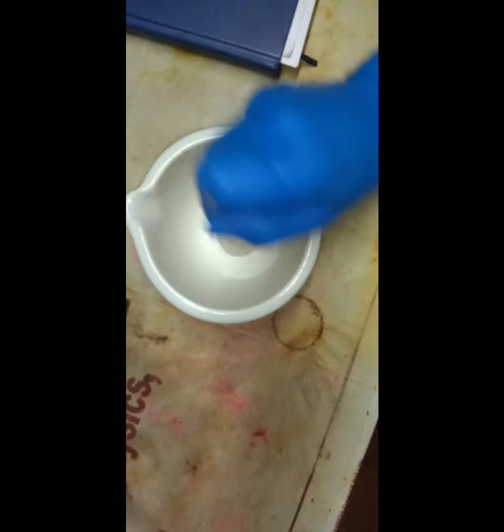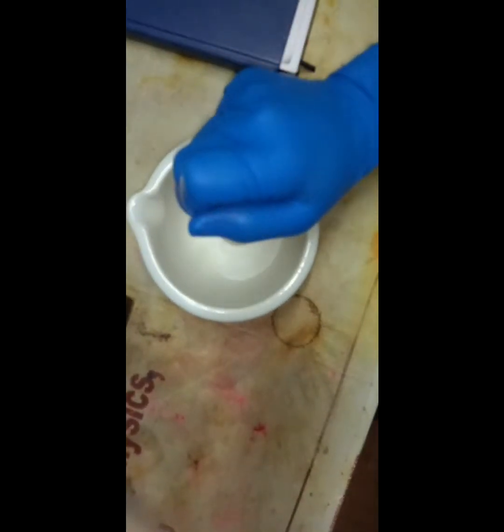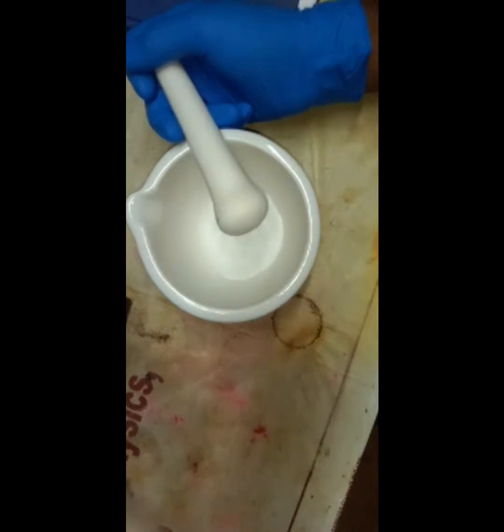We are training to grind the particles and analyze the nanoparticles with powder XRD methods, FTIR spectrometer, or UV visible spectrometer, and in a lot of applications, SEM analysis to find the image.